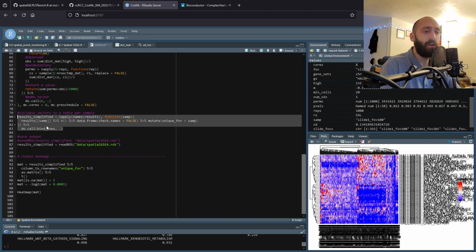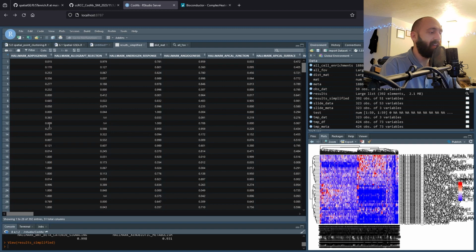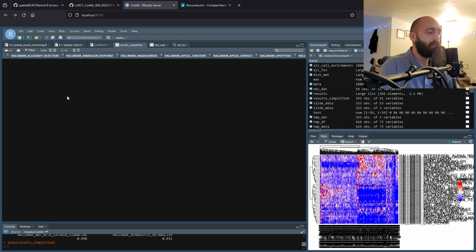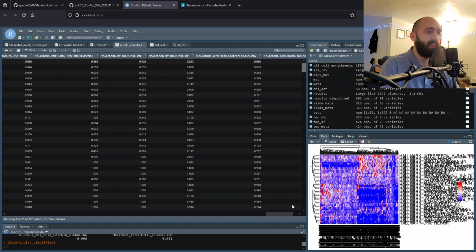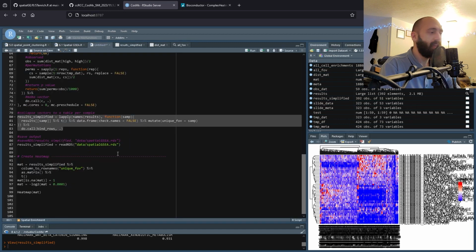And then by binding that all together, we get a really nice data frame where each row is a field of view, 392, and each column, except the very last one, is our gene sets. That very last column, like I had said, is going to be our unique field of view. All of the values in this row are associated with this field of view, and these are p-values for that gene set. And then I just saved it out.